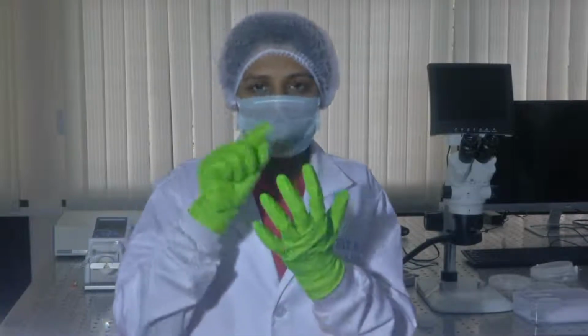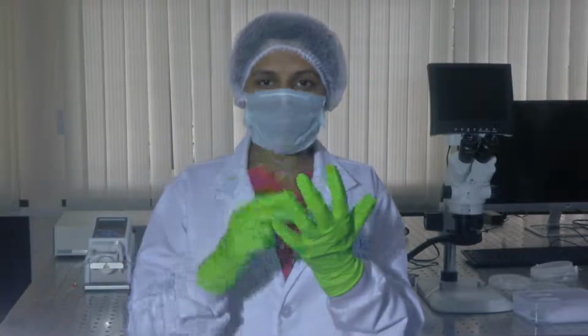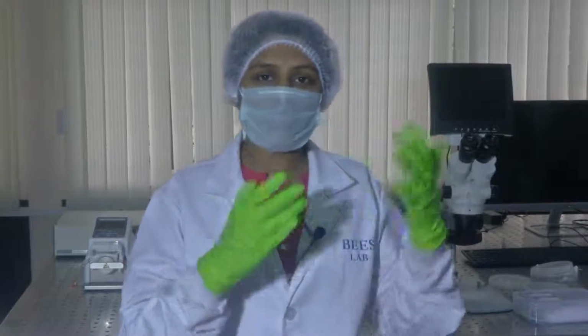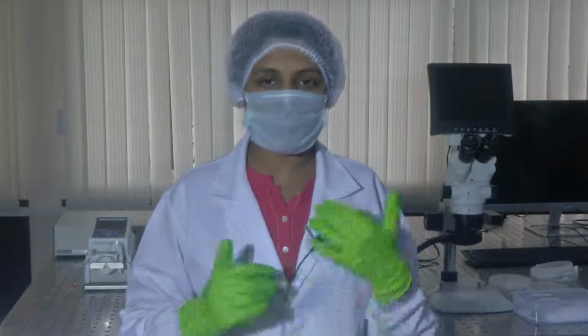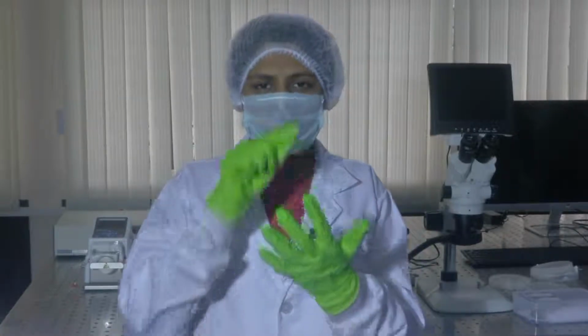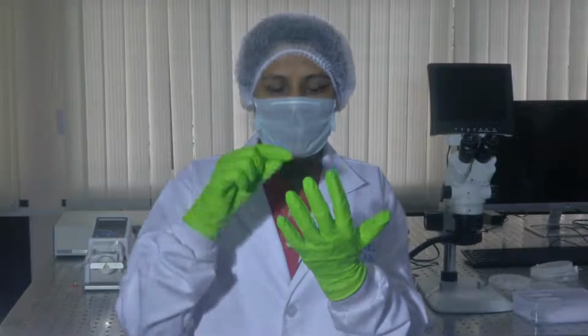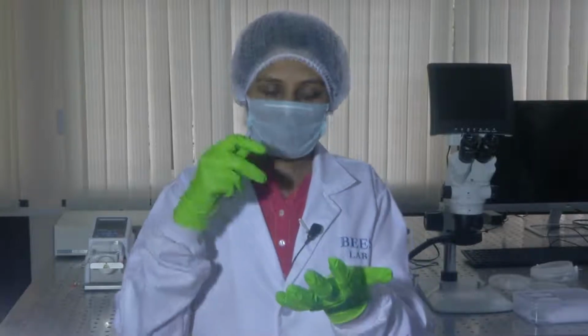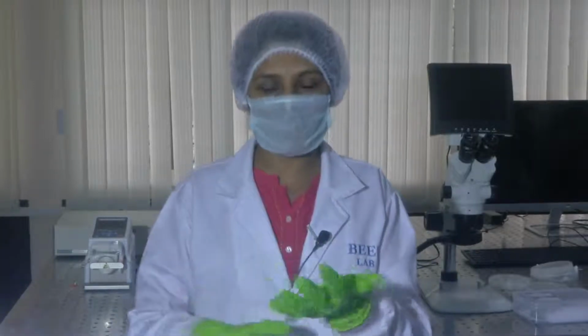The number of rollers could range from 2 rollers, say 180 degrees apart, to 8 or even 12 rollers. Let us see how many rollers we have in the device which we will be demonstrating. When you increase the number of rollers, it is the pulse frequency and the amount of fluid being pumped that changes. So let's get hands-on with the peristaltic pump, which could be used to pump fluid through multiple channels.